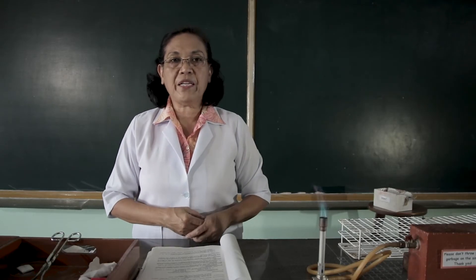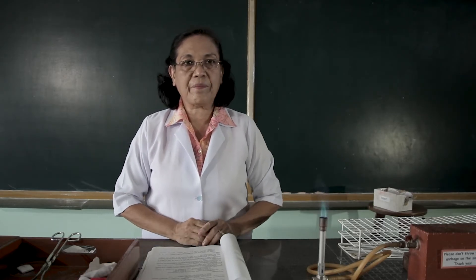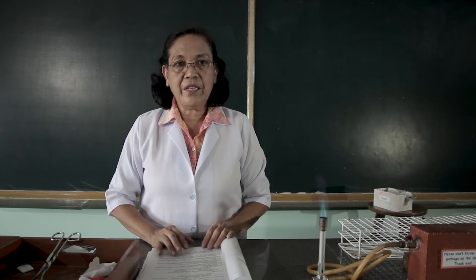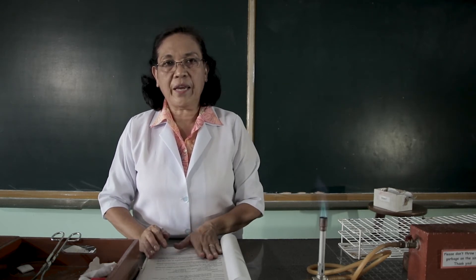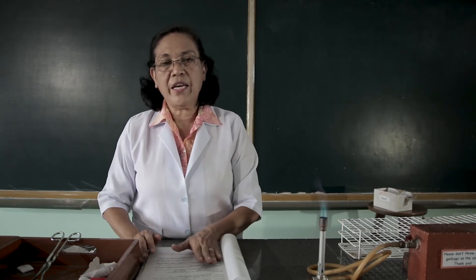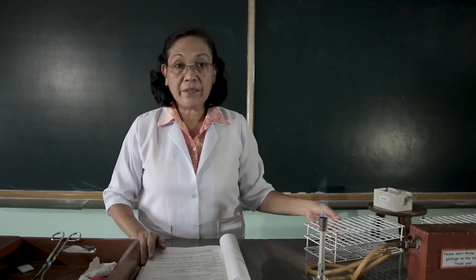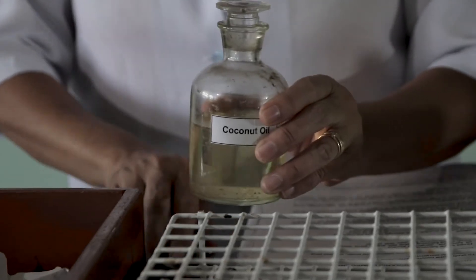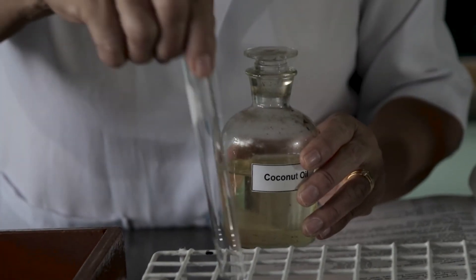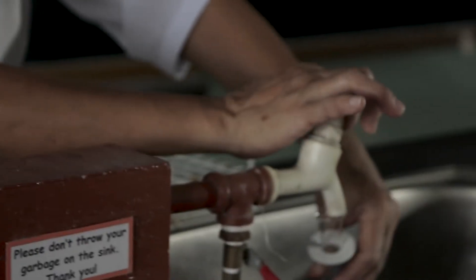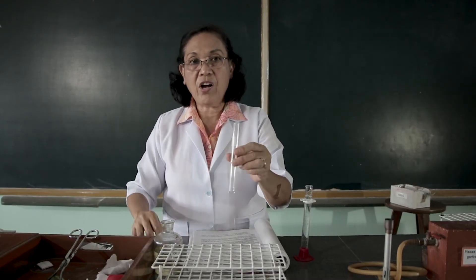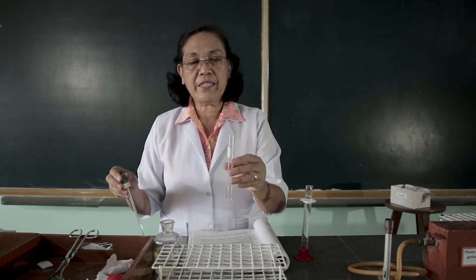The next property that we are going to prove is solubility. What do we mean by solubility? Solubility is the ability of a substance to be dissolved in a solvent. We are going to use here the table salt and the coconut oil, and our solvent will be water. Let's get some drops of the coconut oil.